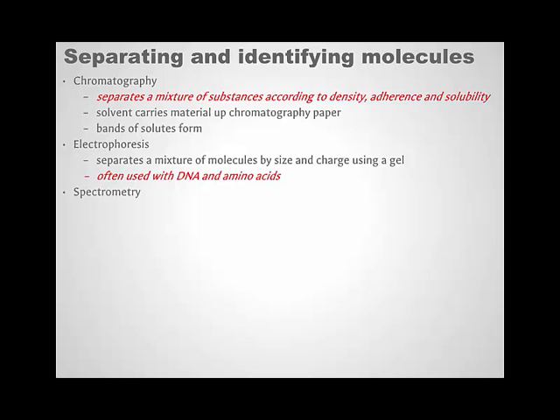And you have a gel. You put samples of DNA or your protein in the gel. It's kind of like Jell-O.